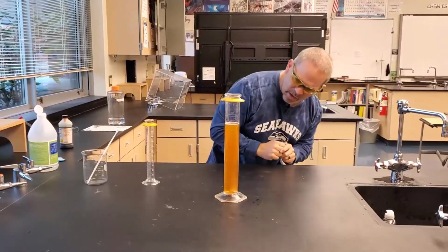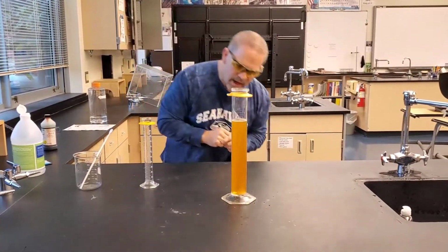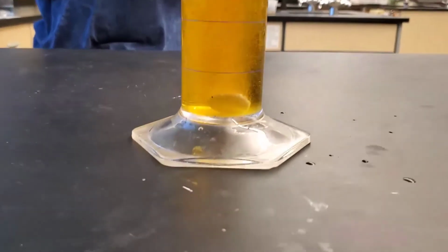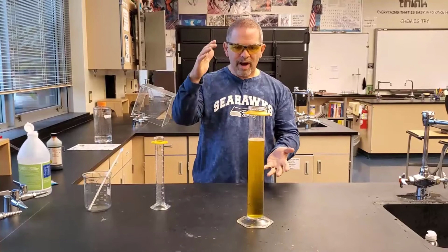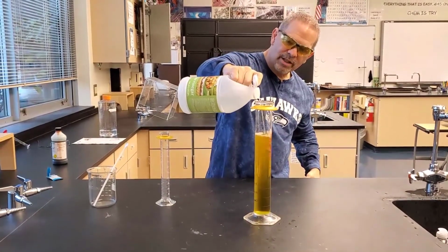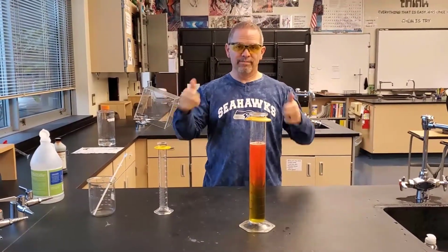Let's let the tablet go a little bit longer to see what our final pH is going to be. Yeah, this Alka-Seltzer tablet's working pretty hard. So we've got our yellow color, big color change. Let's add just a little bit more to spice this up. So watch the sign of a chemical reaction. There we go. Little cherry on top. So chemical reaction number 3, color change.